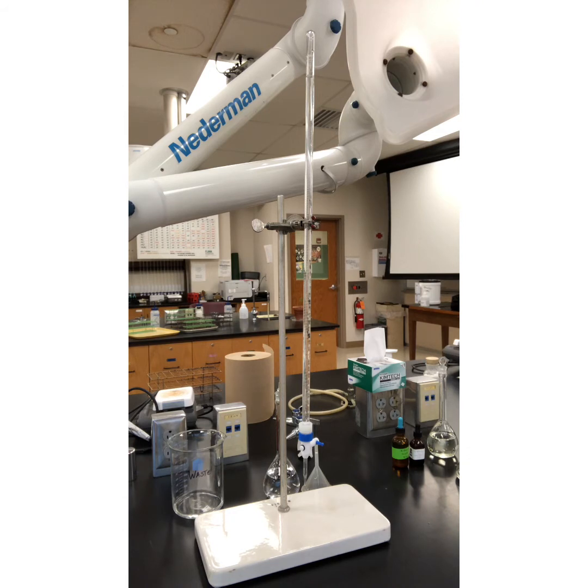We get about 5 milliliters. It doesn't need to be perfect. All right, pretty good. So there's about 5 milliliters of 3 molar sulfuric acid. Go ahead and add that.